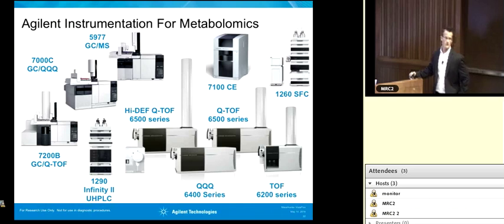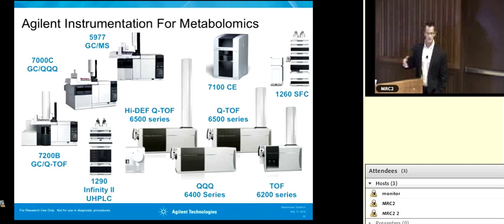Another visualization, which is not related to 2-HG but is still useful, outlines some of the visualizations you can use. You're visualizing the results you saw in ProFinder, but this time in the context of the pathway. One of the other metabolites that we looked for in our targeted list was oxidized glutathione. We can see what's happening to some of the other metabolites downstream, and we can see that there is uptake of the 5-carbon labeled glutamate in oxidized glutathione.